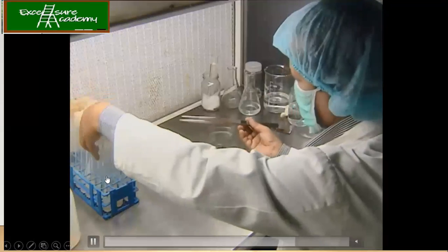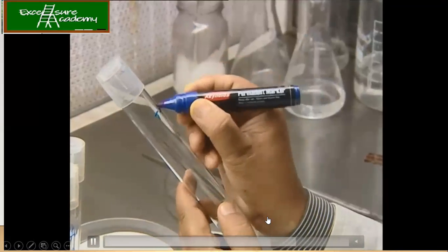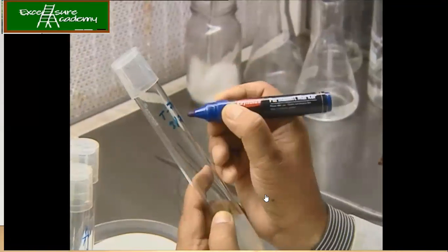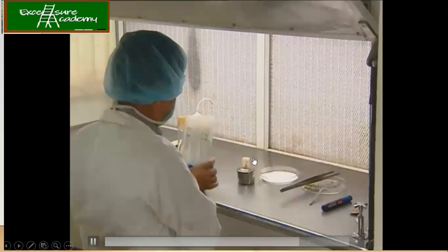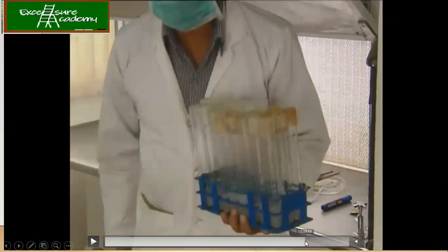Now, these are the media which you have prepared. Solid media it is. Now, label it first. Every time keep your marker ready because you never know when you need it. Don't share it. Put the date and your name also. Then insert the inoculum into the agar media, and take it and put it into the incubator.